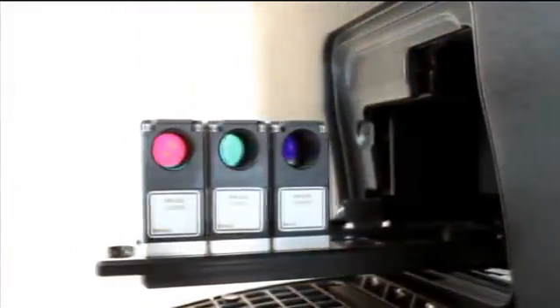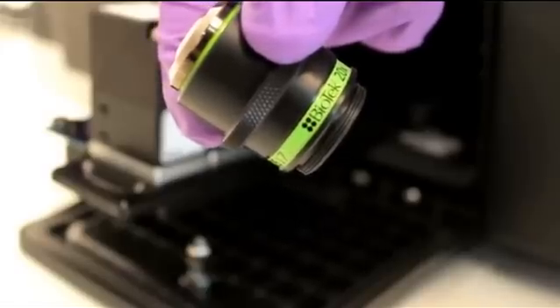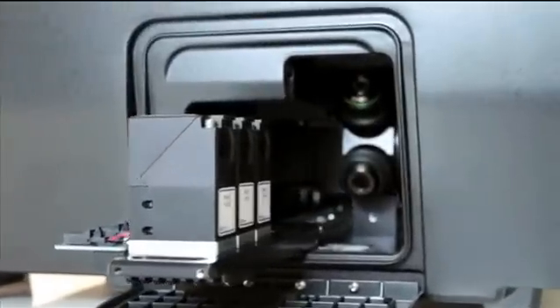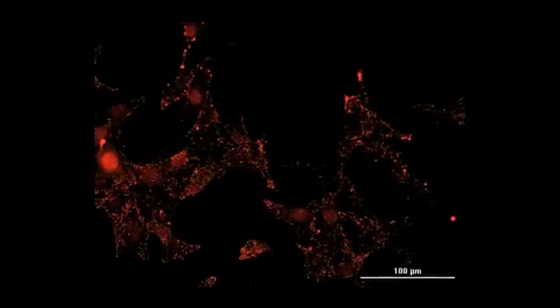The automated microscope optics include high-intensity LED illumination, Semrock filters, Olympus objectives, and a 16-bit grayscale Sony CCD chip for best optical performance. Along with standard bright-field imaging, Citation III offers four-color fluorescence imaging.